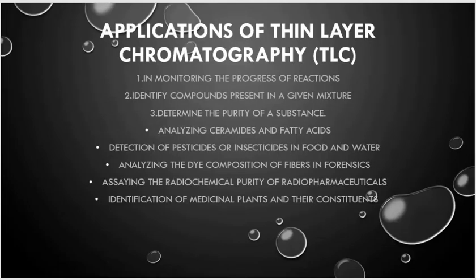Now we have the applications of thin layer chromatography, that is, how we use it. It is used in monitoring the progress of reactions.